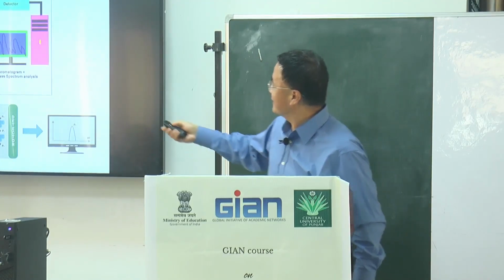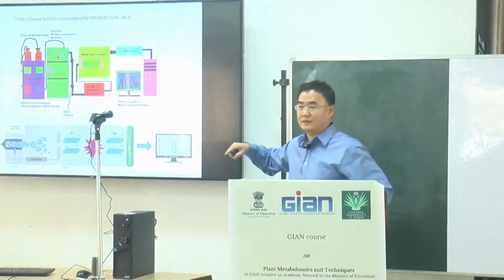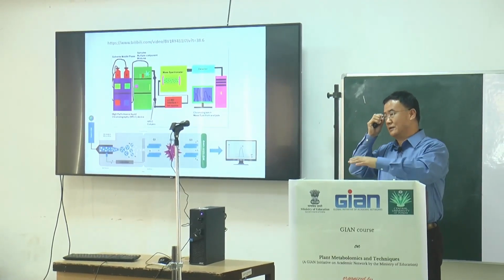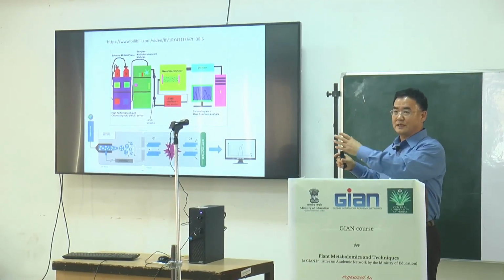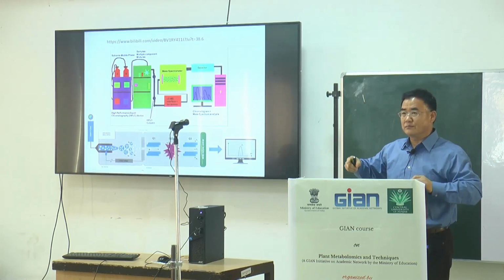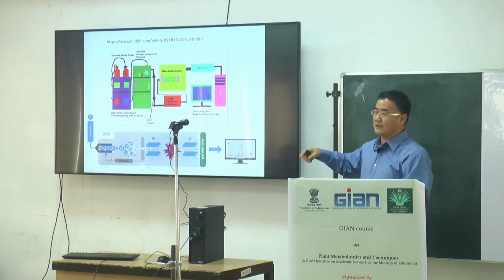Yesterday we talked about mass spectrometry. The core part is the ionization and the way they isolate the ion. So now we know the mass spectrometer is the most important part. Right? With regular HPLC, we can analyze known compounds at abundant levels, like flavonoids and anthocyanins.